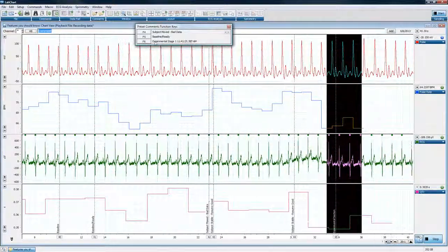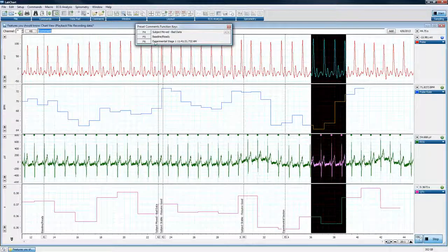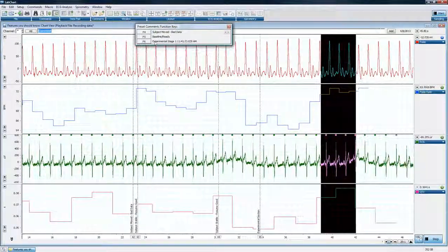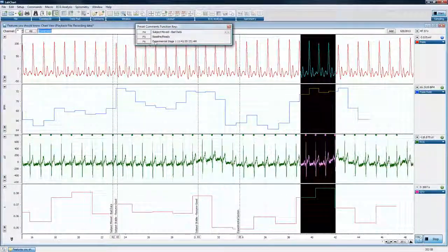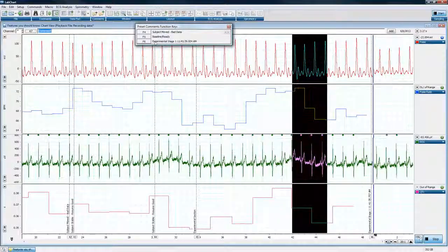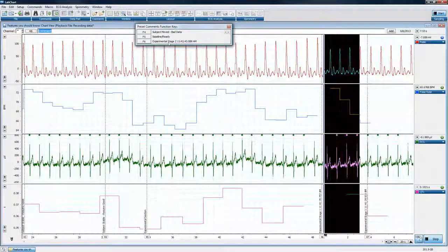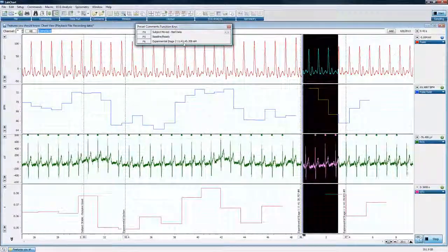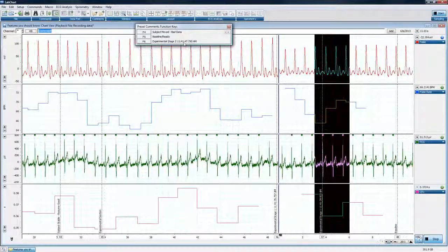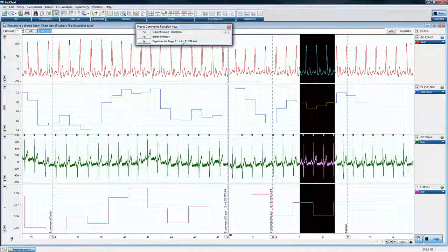The last one that we have here actually in F6 is a special comment with some smart features on these preset comments. What you can do with this is, if I click on F6, you can see that the first comment that went in said experimental stage 1. The next comment, if you look at the list now, it says experimental stage 2. It also shows the time live. Okay, so it's 11:41 here.